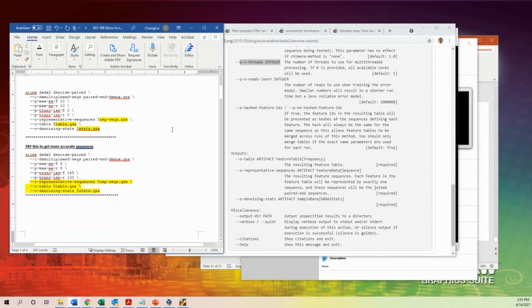Good. All right. So this is your homework. If you don't have any question, I will see you again next week. And make sure you process until this command. Everyone should process all the way to this command. Very good.